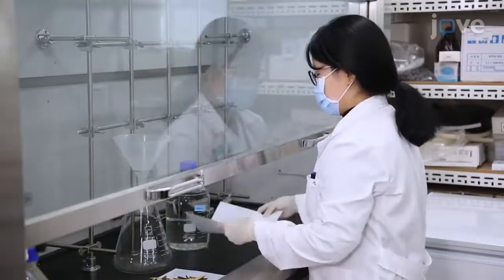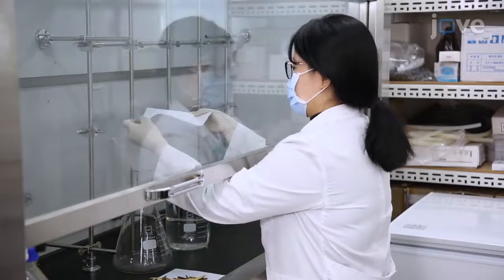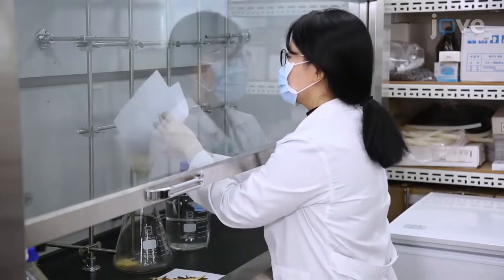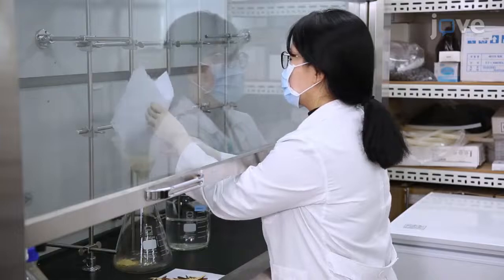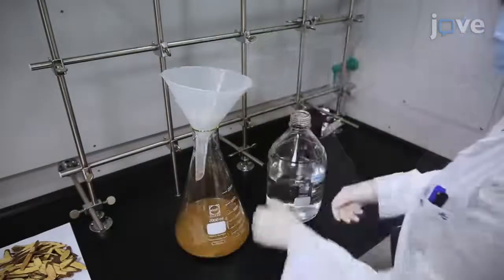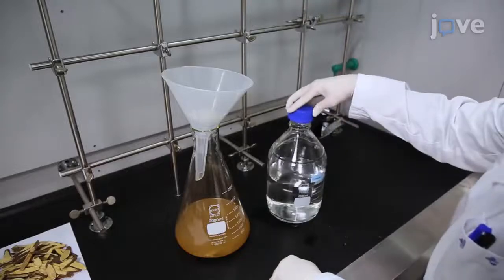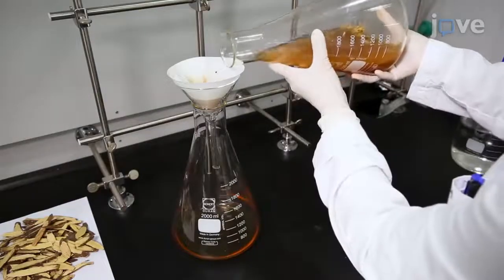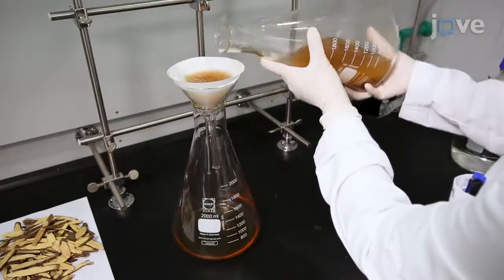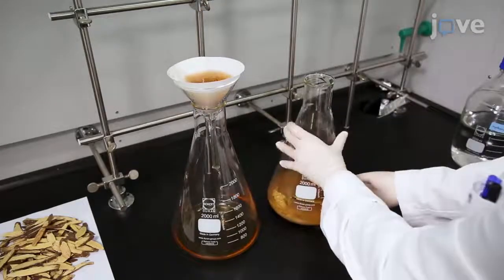To prepare the Glycyrrhiza radix et rhizome extract, or GREX, first add 200 grams of Glycyrrhiza radix et rhizome, or GR, to 2 liters of methanol for a 5-day incubation at room temperature. At the end of the incubation, strain the solution through 0.26 filter paper with a 5 micrometer pore size.